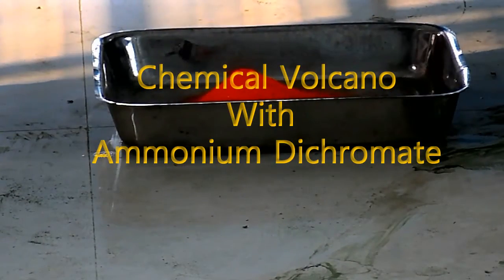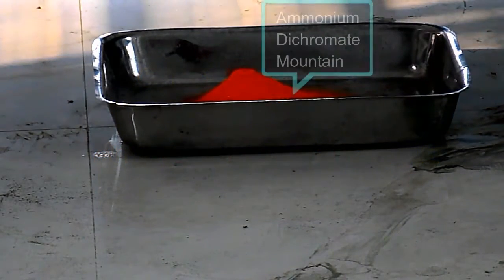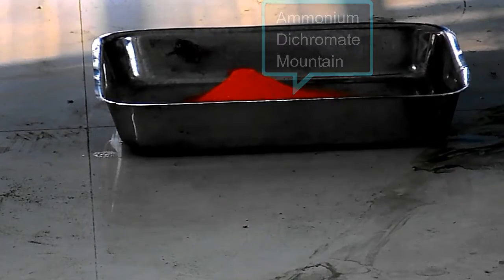Here we are performing the ammonium dichromate volcano experiment. My friend Ria Shambuddha is going to light up the ammonium dichromate mountain that we have created. Let's see what happens when ammonium dichromate ignites.